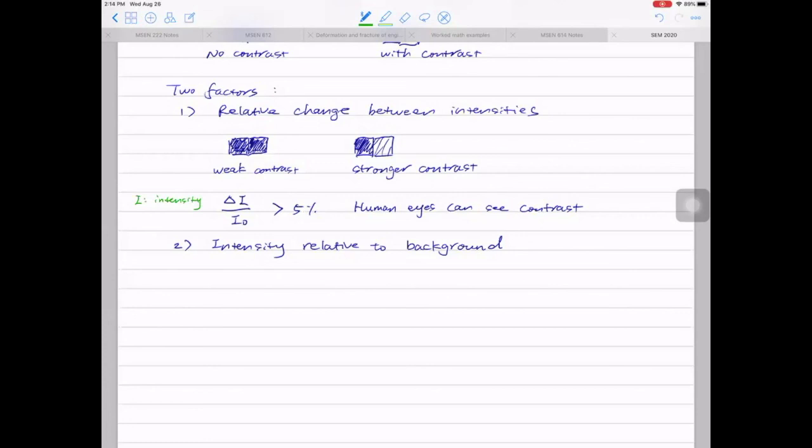But for intensity, the most intuitive way is to look at, on a gray scale, how gray it is or how bright it is, how dark it is. Does this make sense? Okay. Any other questions? Let's move on.